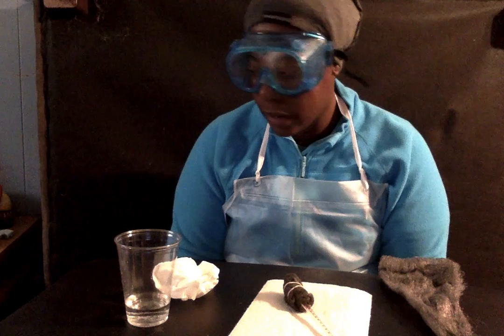Just while the time's going, so the last couple steps after you photograph your observation, you want to remove the thermometer from the steel wool, rinse the thermometer and graduated cylinder with purified water. You want to discard the paper towel, the steel wool, and the rubber bands in the trash. You want to make sure to always discard anything you're using in experiments properly. Make sure they're getting in the right place.